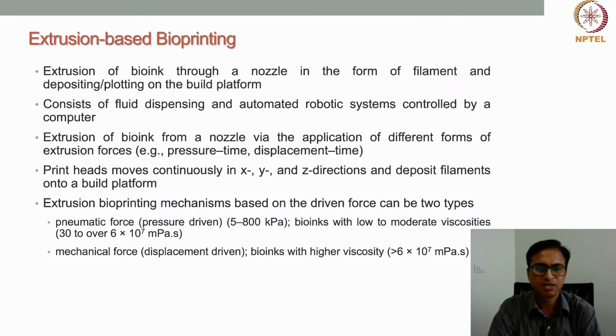That is extrusion based bioprinting, right? Now the pressure that is applied on the syringe for extrusion based bioprinting can be of different types. Either it can be pressure time, that is, pressure can be changed with time, or it can be displacement time extrusion forces, right?